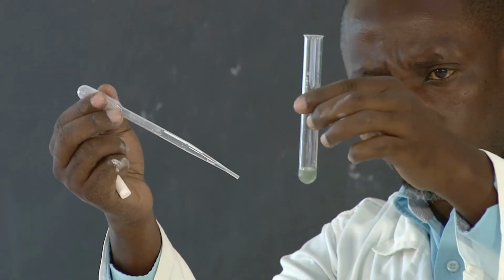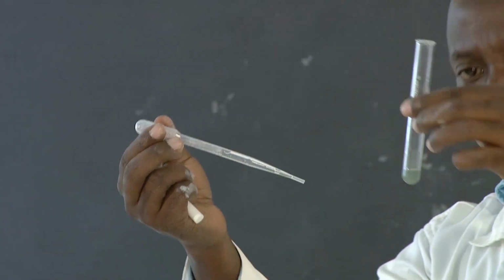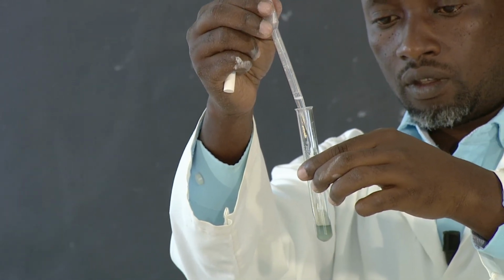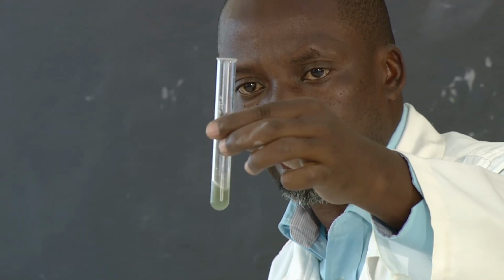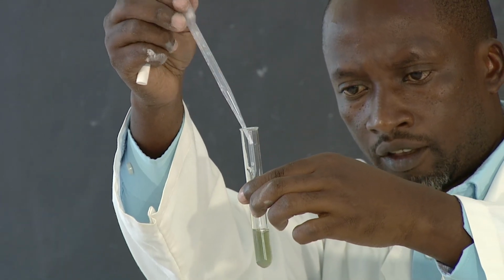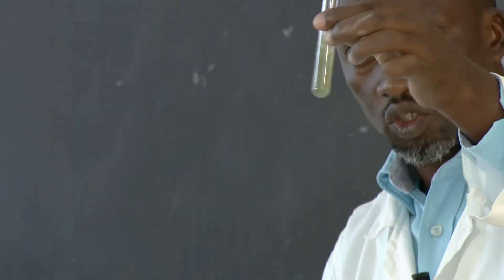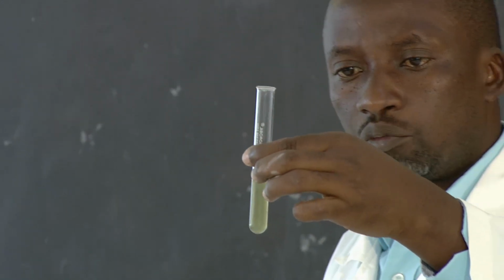See what is happening? Something jelly-like. So sometimes we call it gelatinous. It is a precipitate. So let's add excess. What kind of color is that one? So the precipitate is insoluble. It doesn't dissolve, so it is not disappearing. So this is green precipitate.